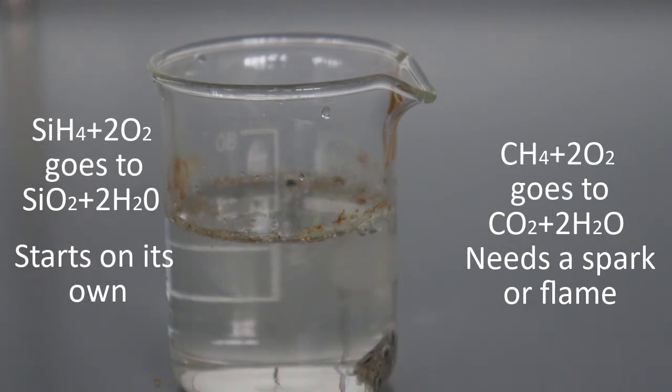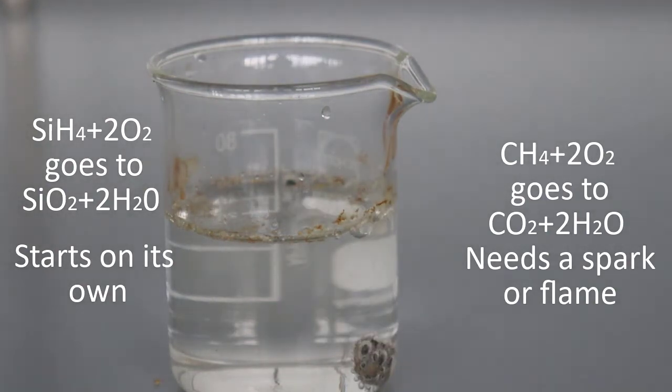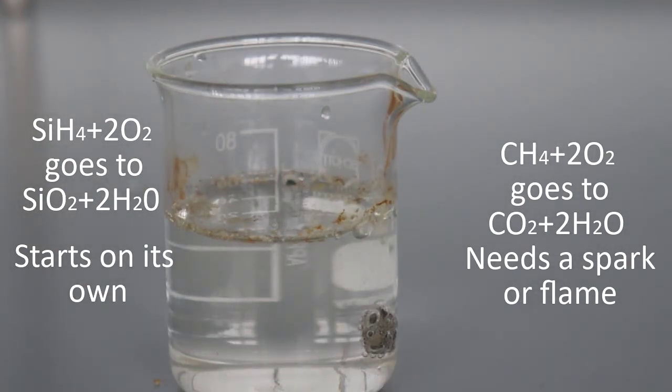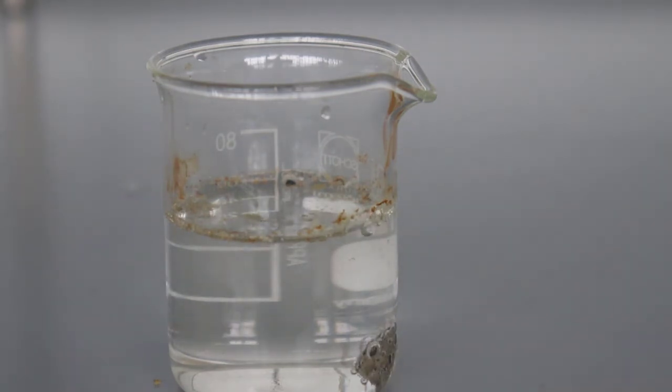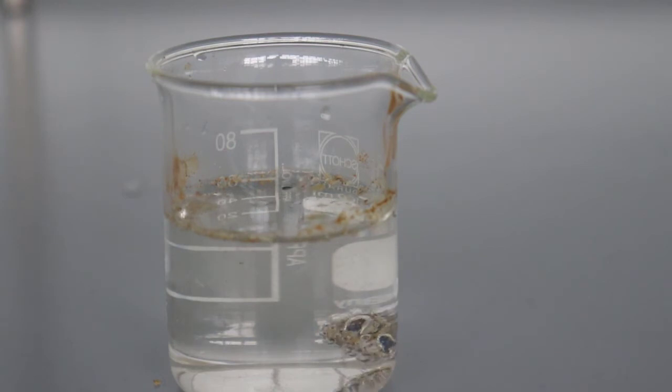This is to demonstrate that the speed of the reaction and the amount of energy of the reaction and the ease of starting the reaction are not necessarily the same thing. So we can have a reaction that is slow or fast, and a reaction that is easy to start, starts on its own like this one, or is harder to start, and any of those reactions can give out more or less heat. This particular reaction gives out quite a lot of heat.